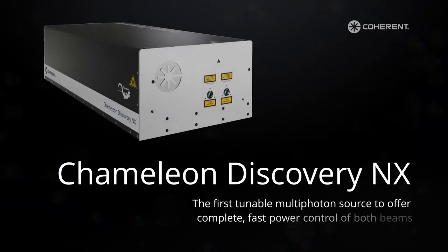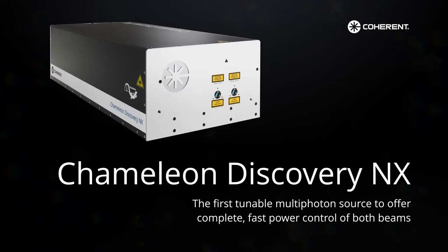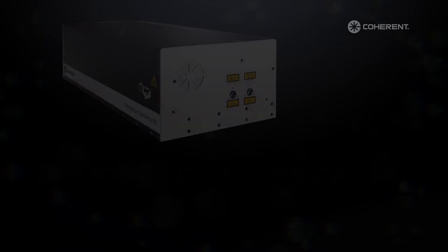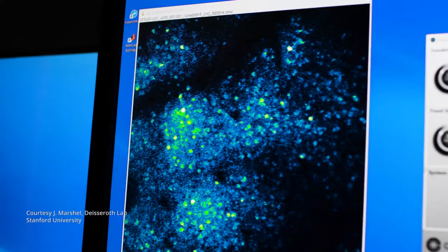The Chameleon Discovery NX is a high-power, octave-spanning, tunable laser that truly redefines possibilities for multi-photon imaging applications.